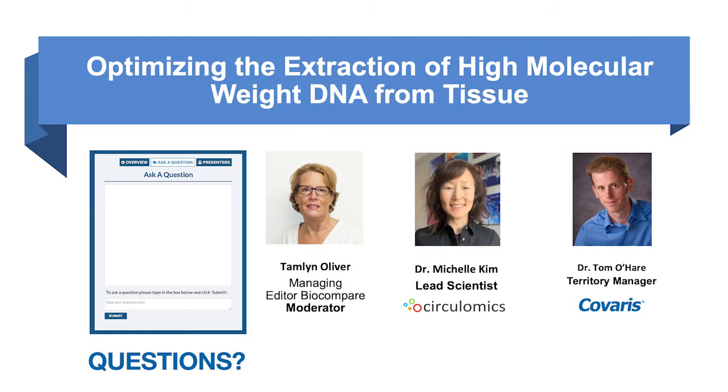However, that is quite a harsh treatment, because we find that people who are using bead beating will bead beat for quite a long time. So we typically don't recommend that, but obviously it's a fine process. I think you just have to fine tune it for your own sample to get the right bead beating solution and the right duration so that you're not shearing your DNA.